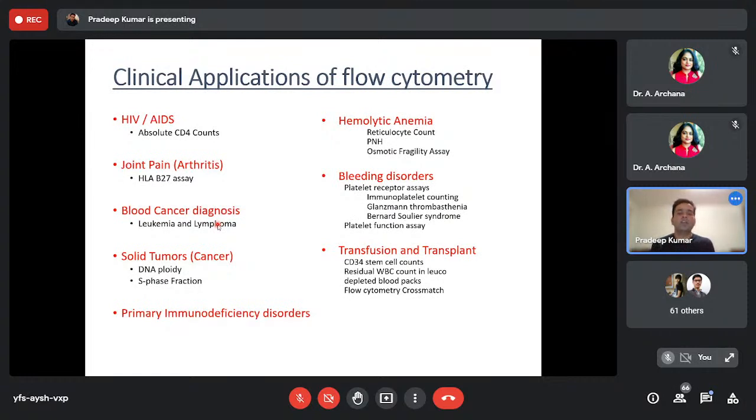And based on that, you can say, because all these cancers are already defined, like acute leukemia will have these specific markers, other ones will have those. So based on that statistics, the percentage positive and negative, more or less, the pathologists decide what sort of treatment we are going to go ahead with for this patient.